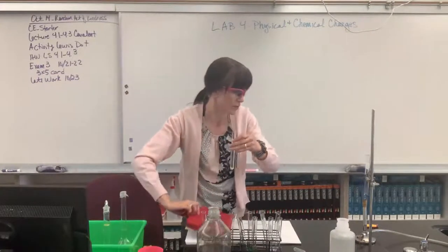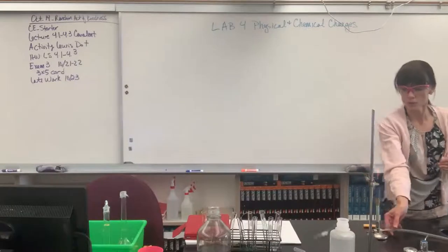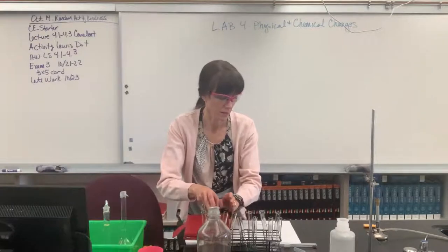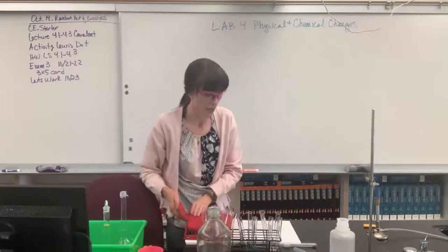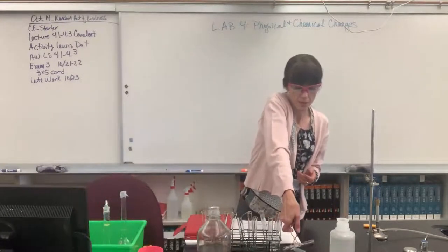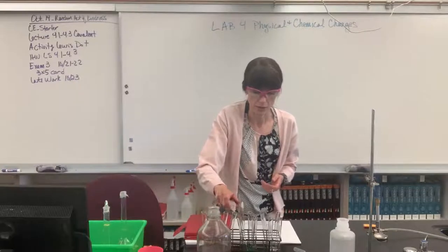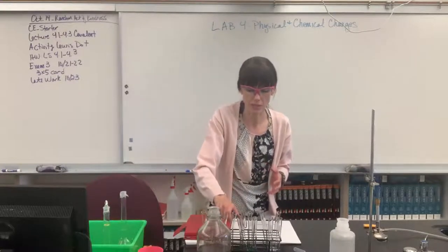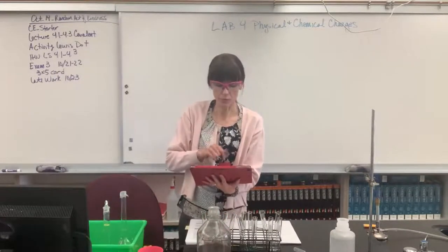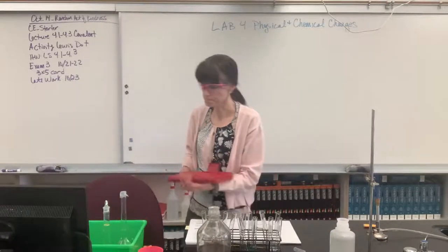Oh, I just heard the timer go off, you guys. I am going to remove the heat. Oh, naughty. It must have been from the heat that the glass shrunk just a tiny bit. So glad that didn't break. I'm going to get my little test tube tong here, pick that up. All right, there we go. And we have to let this cool for 10 minutes. So I'm going to set the timer for 10 minutes to let that cool. This was from part B. Okay, the timer's going. We'll let that cool for 10 minutes and then we'll make our observations.